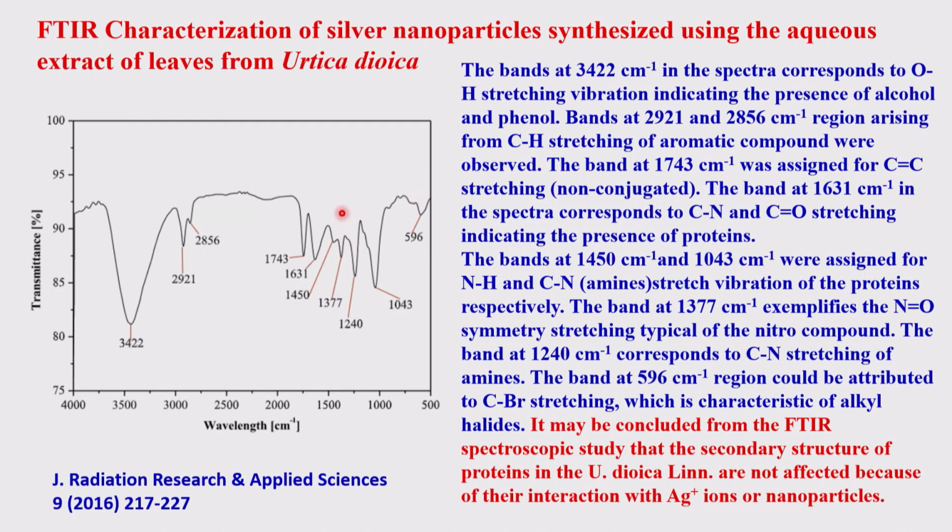So if you try to look at the spectrum of the silver nanoparticles, which were synthesized through this particular solution medium, of course you take silver nitrate in this medium and then use some reducing agent, or it can be auto reduction also, since a lot of molecules present in this extract can themselves act as reducing agents as well. They can cap. So using that also you can make these silver nanoparticles. And now its IR is measured, and that's what you are seeing here.